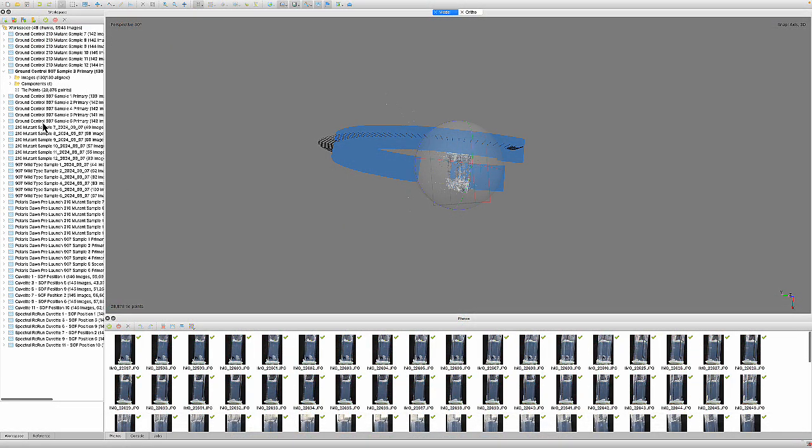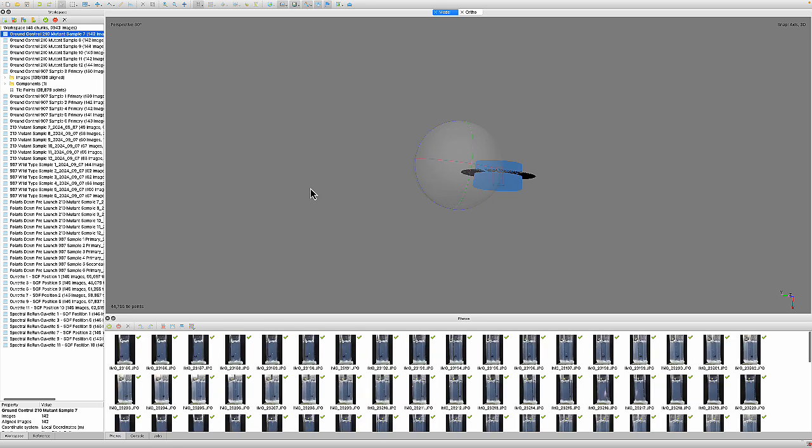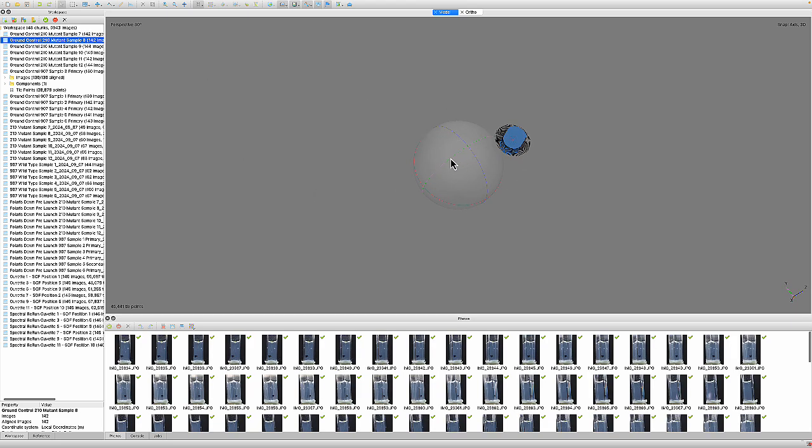Okay, so the initial alignment has finished, but one thing I noticed is that not all of them are perfect. One of them actually failed, so that's actually pretty good. Of all the ones I had to align, with only one failure, I found out the only reason it failed is because the image data, for some reason, wasn't sourced. I guess somehow it got relocated in the directory, so it's a pretty subtle problem. But as I go through these, there's a few that look like they're not great.